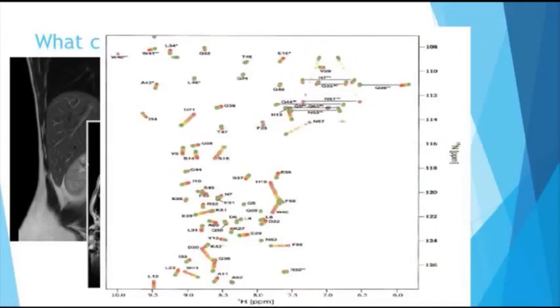So I was looking at proteins and trying to find out where things were binding on that protein. So you take a sample of the protein, you get the atoms, then you add the thing you think will change, and some of those atoms shift because there are new electrons in their electron clouds, and you know that that's where the thing you're looking at is binding to your protein. So that was how it helped me.